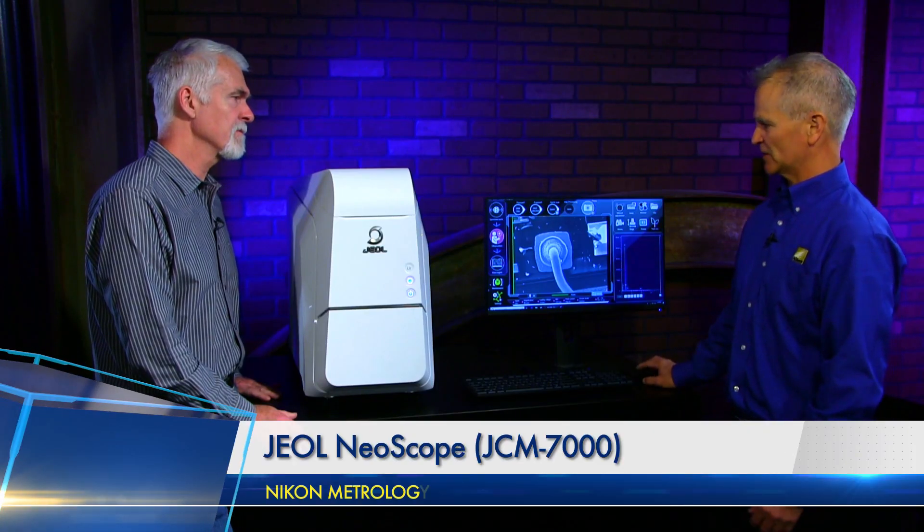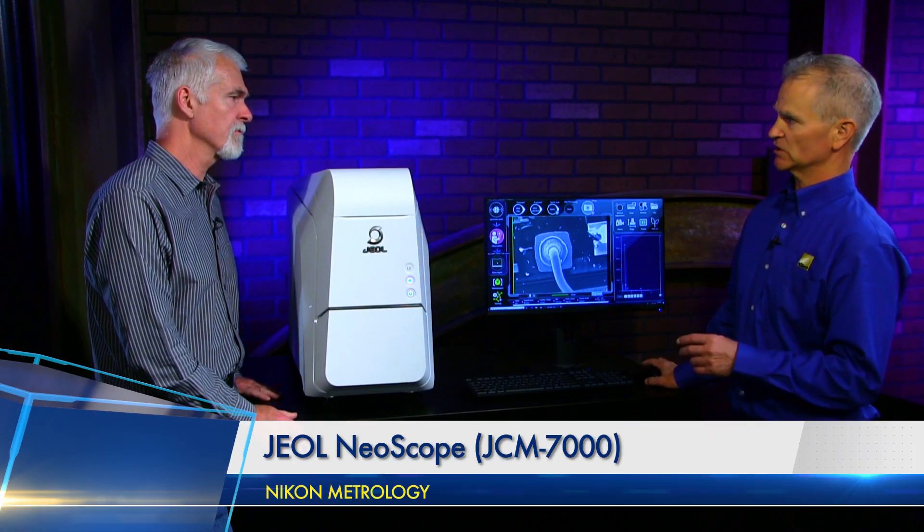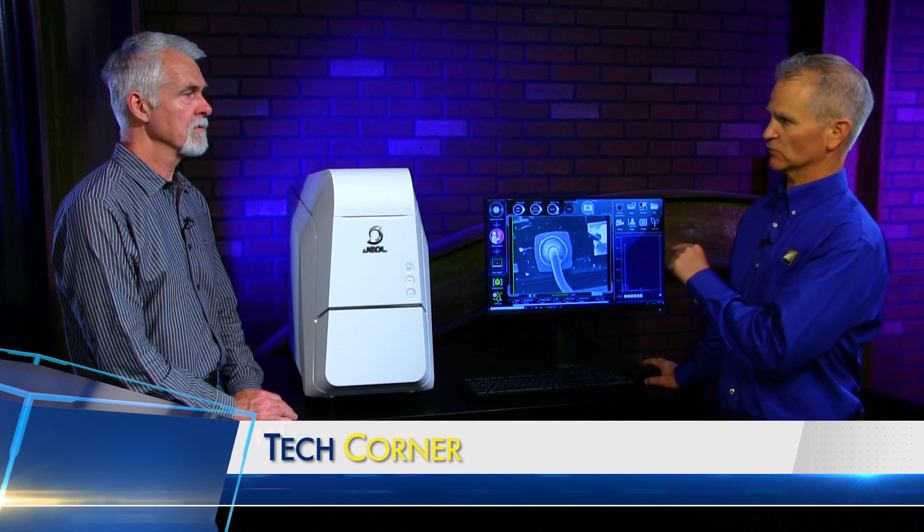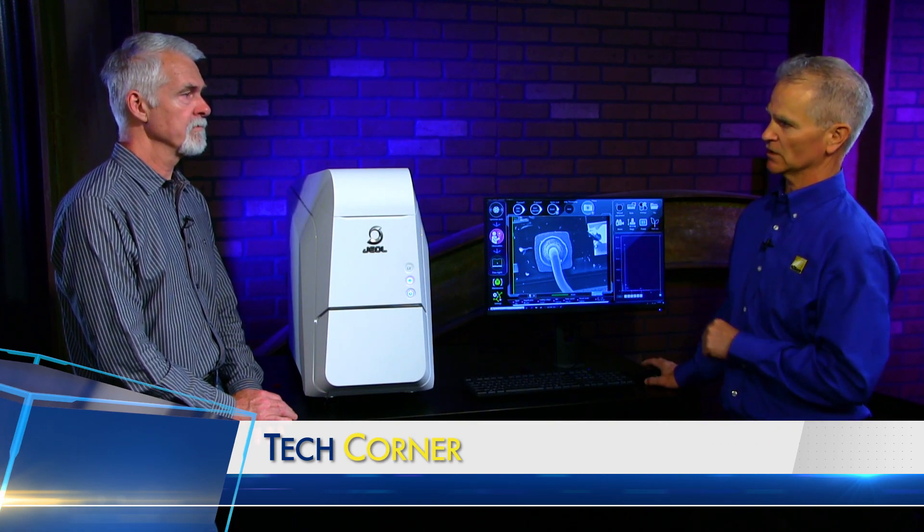This does have data management software on it. All your imaging, documentation, and everything is saved in a very user-friendly format so you can pull up and print your document. You can set templates that are pre-formatted so you can just pick the format you want and send it to that document and get a PowerPoint or Excel document out of it.